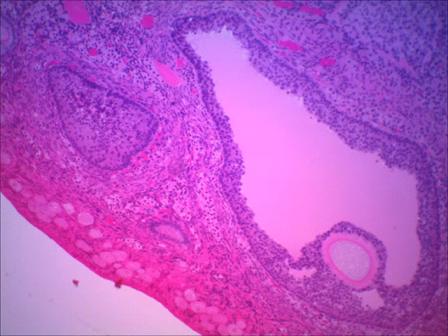On this last slide, here's another view of a very mature follicle. You should be able to pick out the immature egg or ovum or secondary oocyte. You can call it all of that for lab. You can see that right in the middle there. Do you see primordial follicles? Here they are.